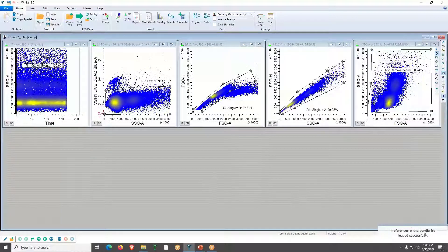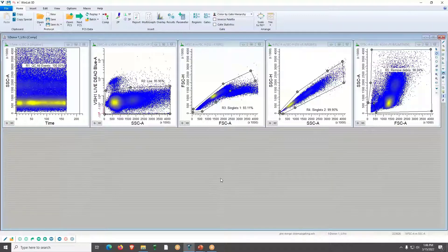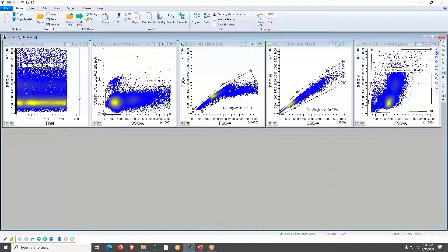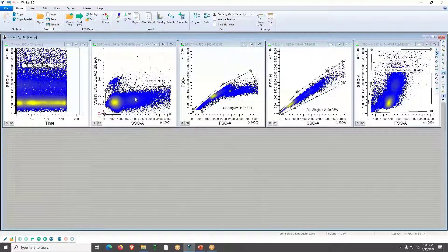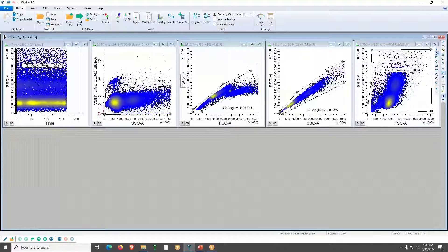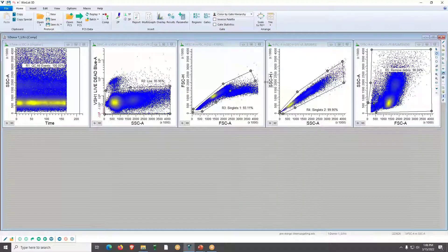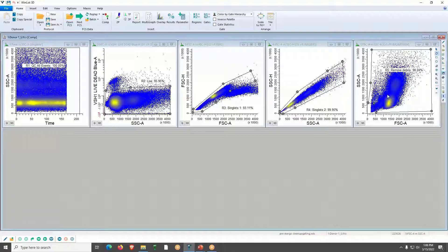You can see that the preferences in the bundle file are loaded successfully because WinList gives you status reports. I've set up a simple cleanup scheme: a FSC by SSC scatter, side scatter by Live/Dead, singlets set up as a ratio of area to height for forward and side scatter, and a basic gate to help remove some debris.